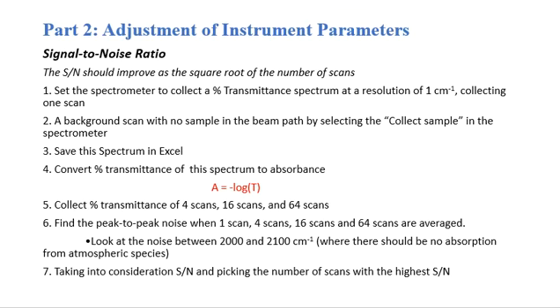Lastly you need to consider the signal to noise ratio. You pick a scan number to use for the rest of the experiment. Basically, you choose the scan number which has the highest signal to noise ratio.